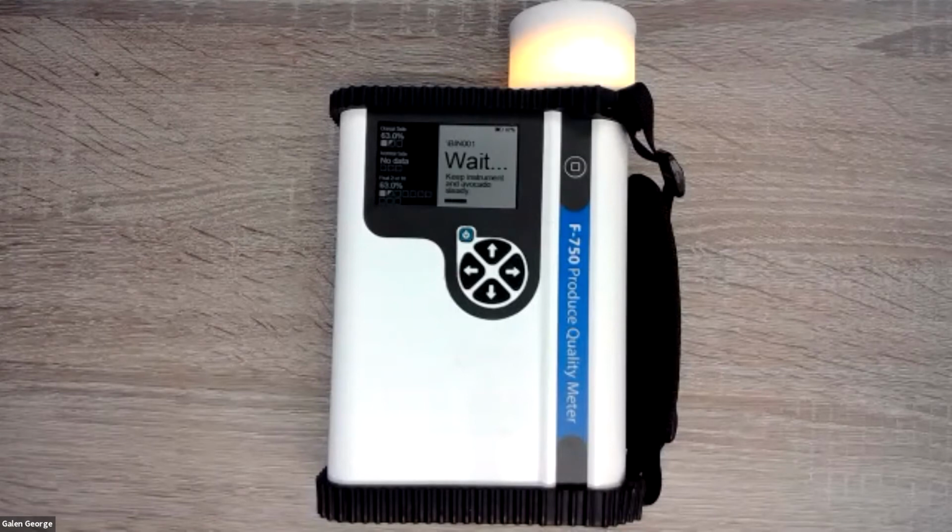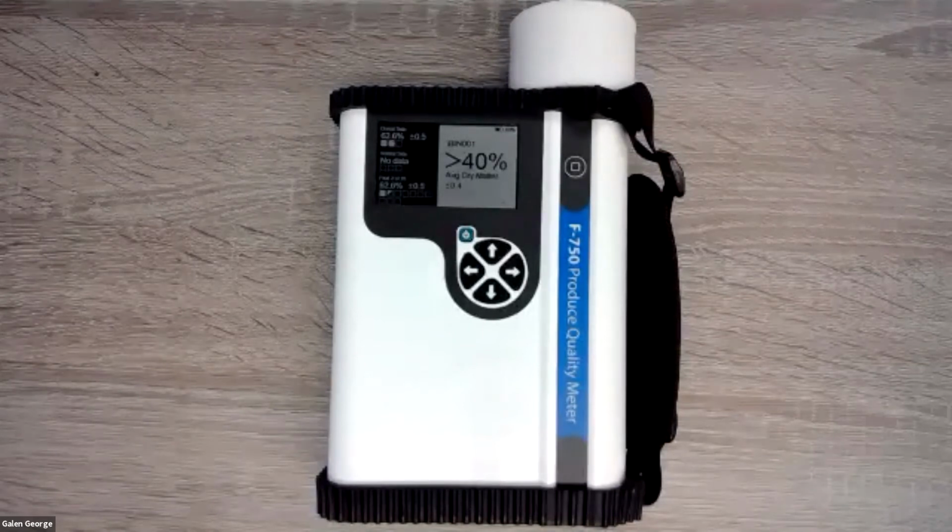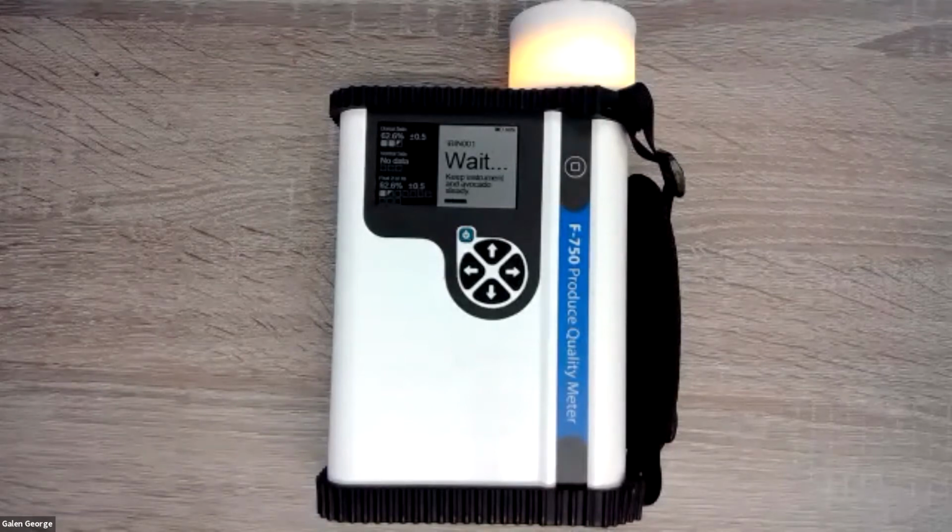You'll see the lamp light up 3 separate times here, and it'll give us that average. The advantage of doing this is that you get more accurate predictions because you're averaging multiple scans. And the idea of scanning 2 sides, again, is making sure you have an accurate average for that entire fruit.